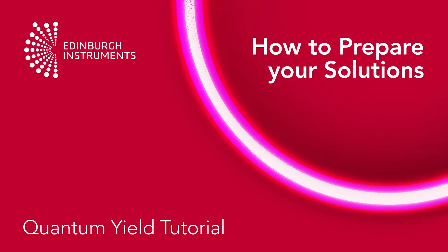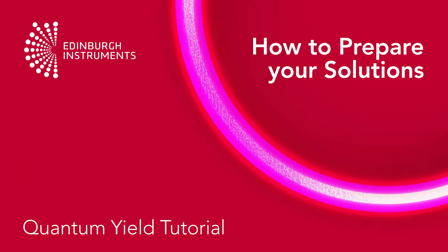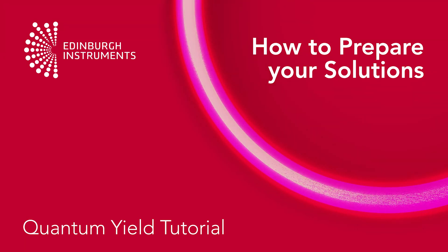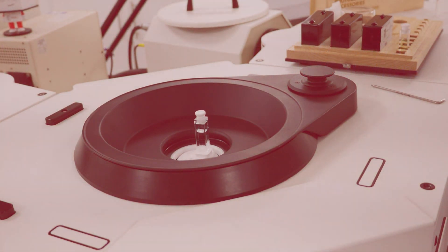Hi there and welcome to this PLQI tutorial video. Today I will show you how to prepare solution samples for analysis with an integrating sphere.